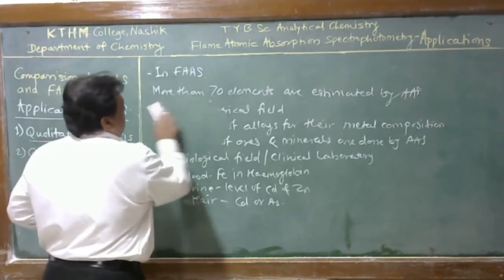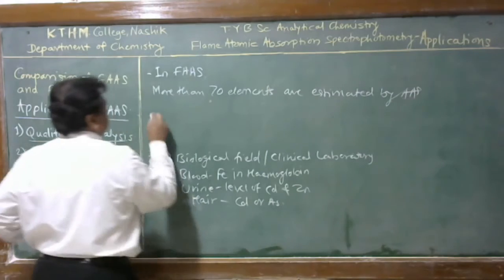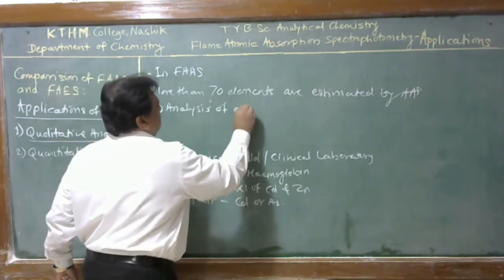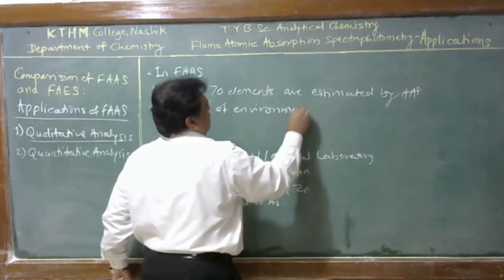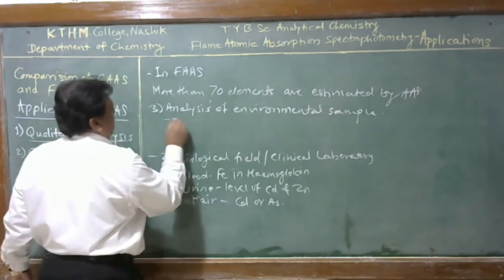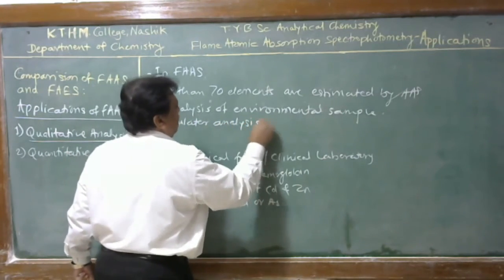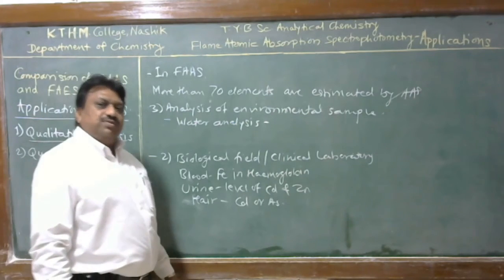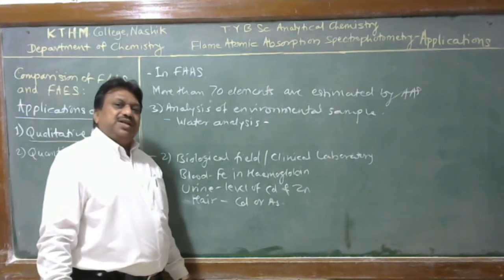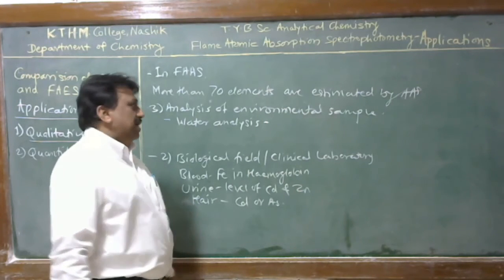The next application is in the environmental field, analysis of environmental samples, such as elemental analysis of water, which may be drinking water, polluted water, river water, or sea water, particularly the metallic species present in the water sample.